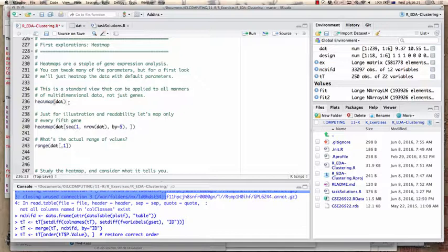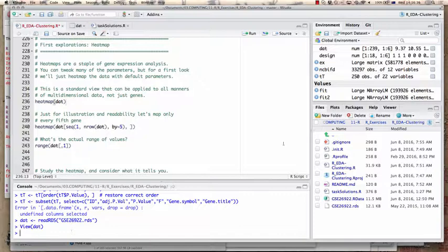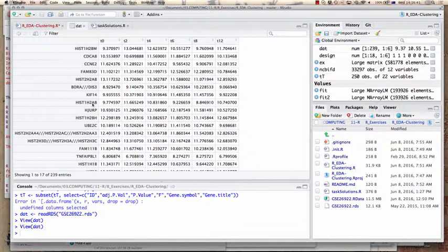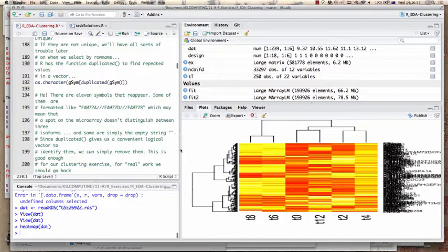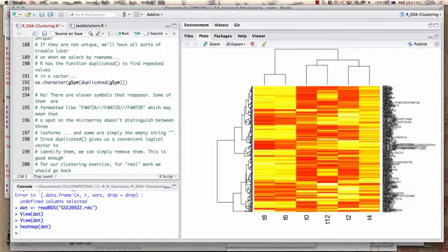Let's have a quick look at our dataset. I hope the dataset you have loaded looks like this on the variable dat — a first column of gene names and then six columns of expression values, T0 to T12, representing the time points. We can simply do a heatmap of that with one command. Without any further explanation, if you see that — do you think this is somehow intuitive or obvious? What are we seeing here?